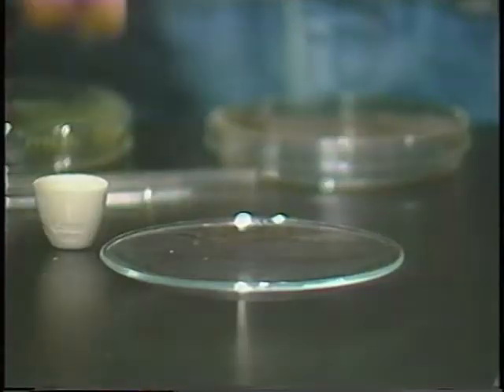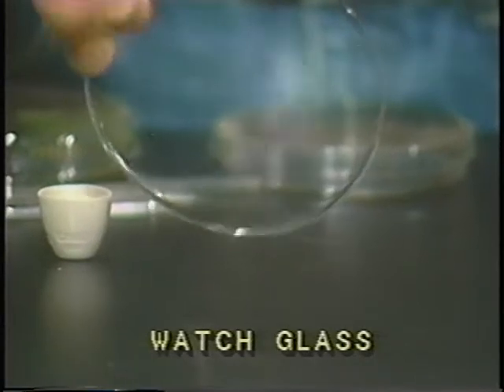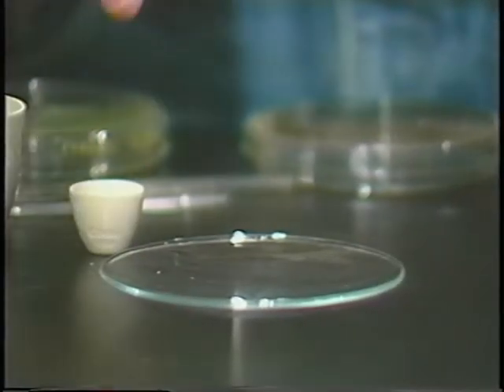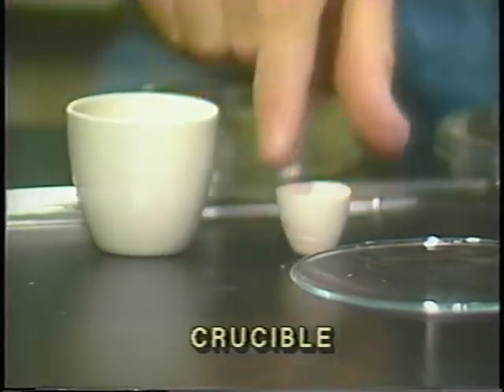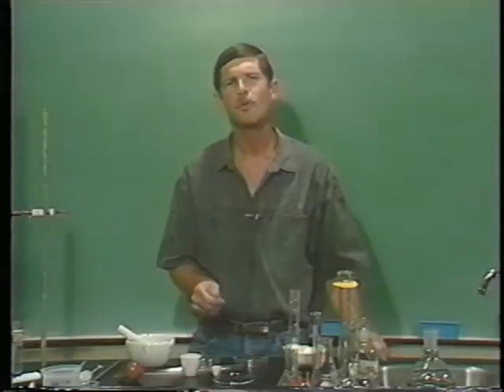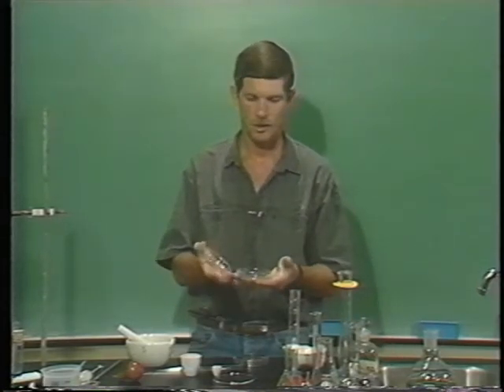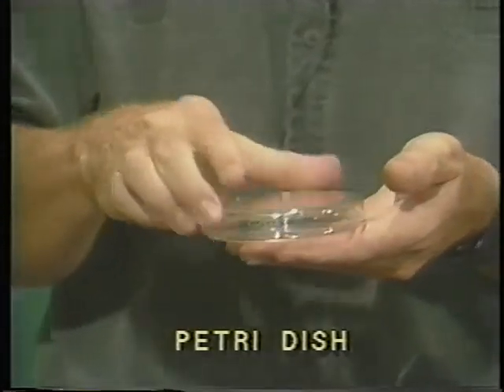Now let's take a look at some of these other items we have down here. This piece of curved glass is called a watch glass. You don't look through it this way, but rather you set it on the table and put things in it to watch. Next to it, we have two different types of crucibles. This is a small baby crucible, and this one is a much larger one. These are made out of porcelain and used to heat things up in. Then if you're working in biology, you should definitely know what this is. It's called a Petri dish, a two-piece glass or plastic dish used to grow microorganisms.